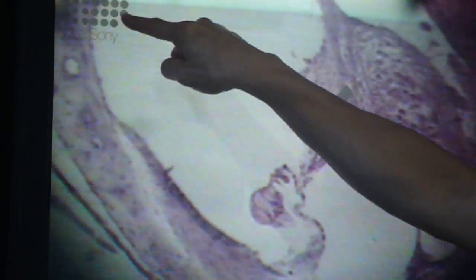This one is the stria vascularis. Behind it is another set of connective tissue, which is the spiral ligament. So there are 3 spirals: spiral lamina, spiral limbus, and spiral ligament. This is the organ of Corti. That is the basilar membrane, and that is the vestibular membrane. So basilar membrane, vestibular membrane, and therefore this is scala vestibuli, scala media, and scala tympani.